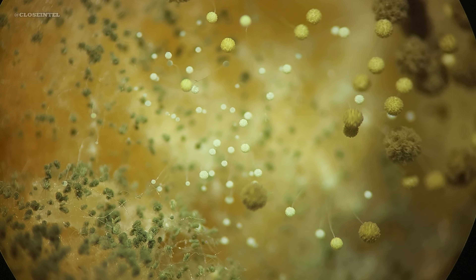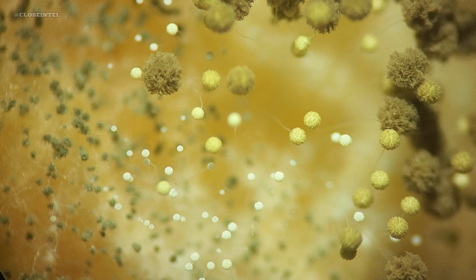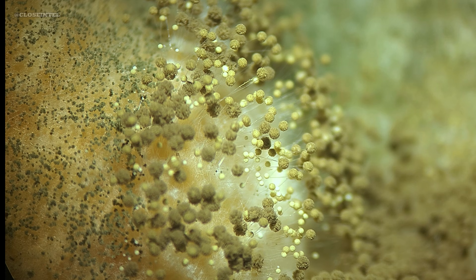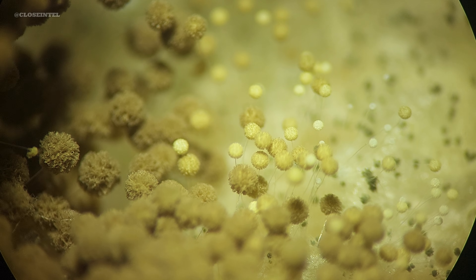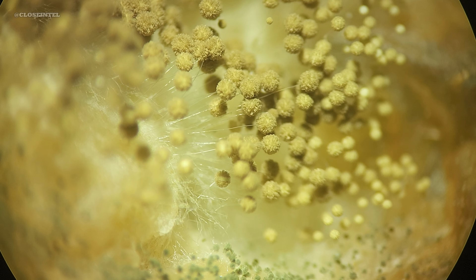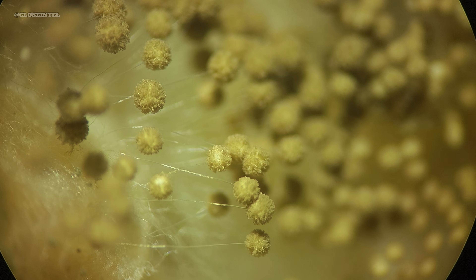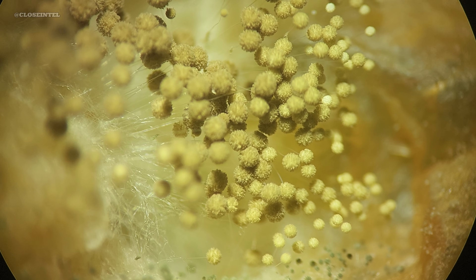Young sporangia are typically smaller and almost translucent or colorless due to the low concentration of spores, while the mature ones are larger and typically dark in color, indicating they are almost ready to release their spores. The final color of adult sporangia can range from gray, black, brown, and other shades depending on the species, environmental conditions, and the specific pigments produced.